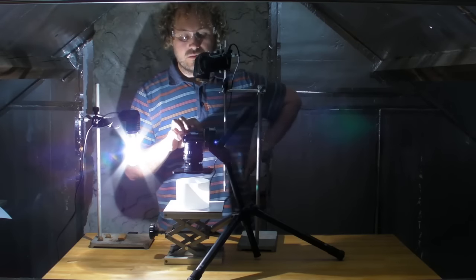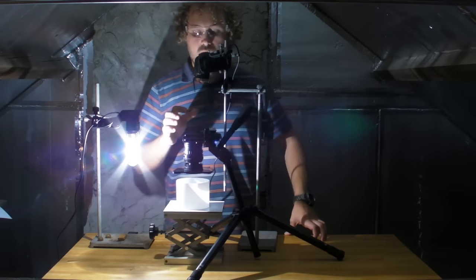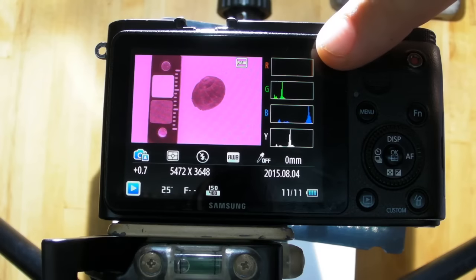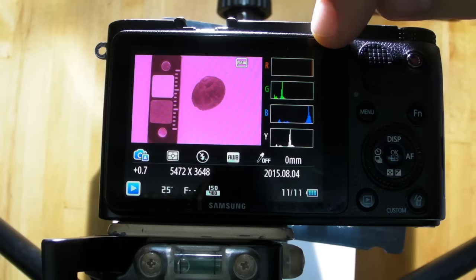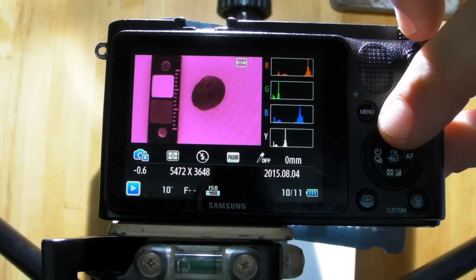Now once we've taken the photos, it's always good practice to check the exposure of the photos. Most cameras should be able to show you RGB histograms, red, green, blue histograms. Here you've got the red, green and blue. This UV shot looks very overexposed, and you can see that the red here is all clustering up at the right hand of the histogram, so that means they're overexposed values.